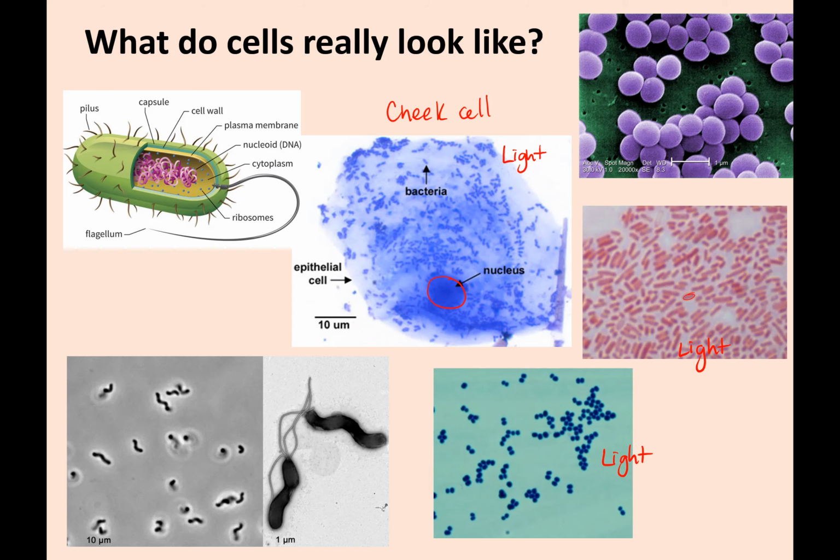These are bacillus, little rod-shaped. These are circular cocci. I can't tell if this is staphylococci. It looks like a staph infection. This one up here is electron microscopy. This is scanning electron microscopy with false coloring. This would be Staphylococcus, like epidermidis or whatever this guy is.